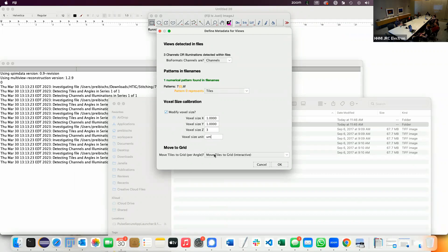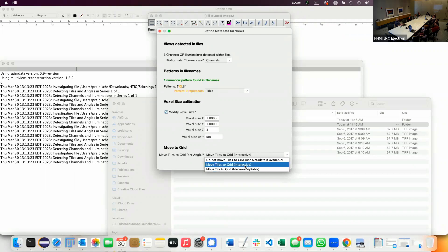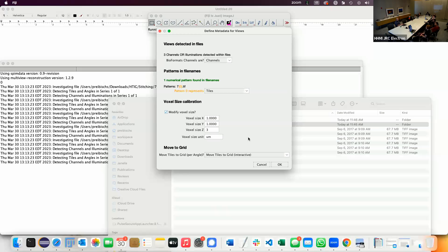If it's a grid you can move tiles interactively to the right location. If you have a CZI file it will read the tile metadata from the file. Here it won't because there's just nothing in there — six files and it doesn't know what to do. All of this is macro recordable — there are macro-scriptable versions of each step. So the first time you look at some type of data you go all manually, but then you can automate everything. You can even run this on the cluster distributed — if you have a thousand time points you can separate by time point.